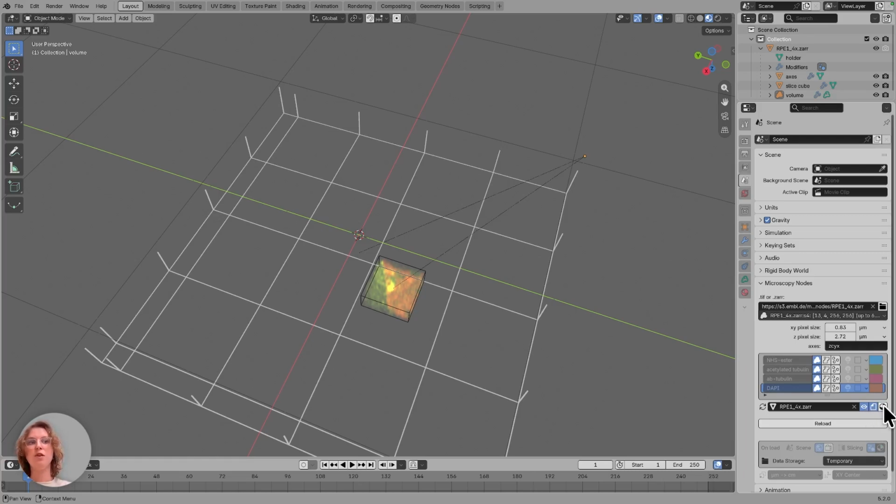And by default it will already turn off the application of the settings. This means that only the voxels that remain after spatial masking will be reloaded into the higher resolution. So if we now go to our highest resolution, it will make a map of all the voxels that we currently have active and ask for only those from our dataset.